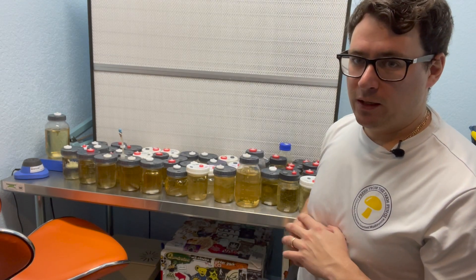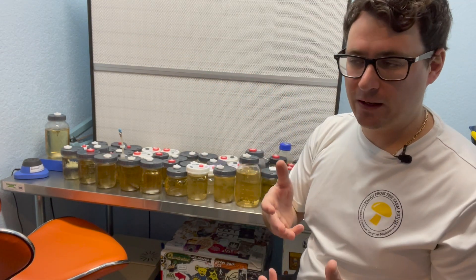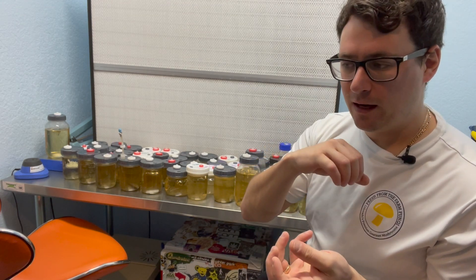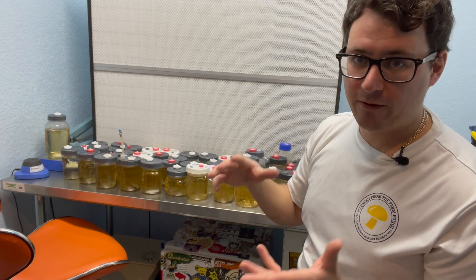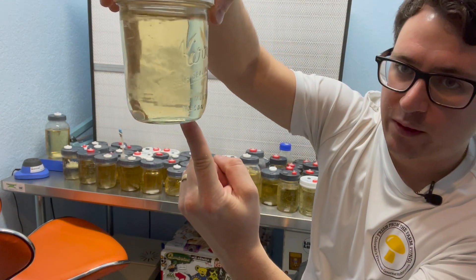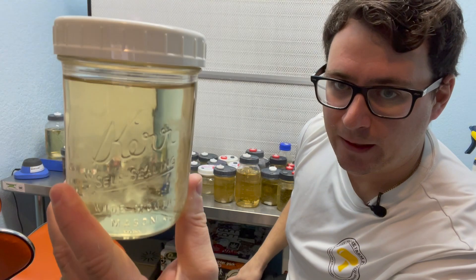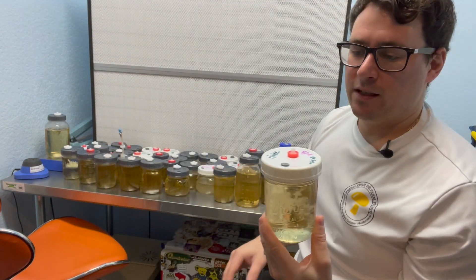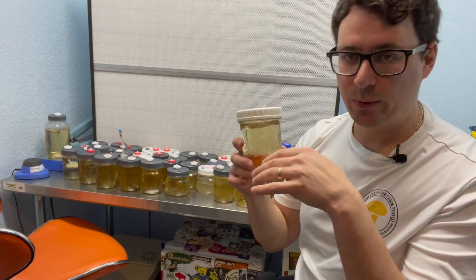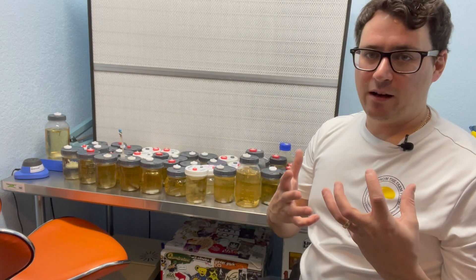So the next thing we're going to do is take an aliquot from every jar and put it onto agar. Agar is a tool that is used to filter out the growth of the mycelium into two dimensions. This right here is a three-dimensional substrate — the mycelium will grow in all directions and can potentially hide some contaminants. So we'll take a small sample using a syringe and plate it onto agar, and that way if there's any contamination present, it will show itself.